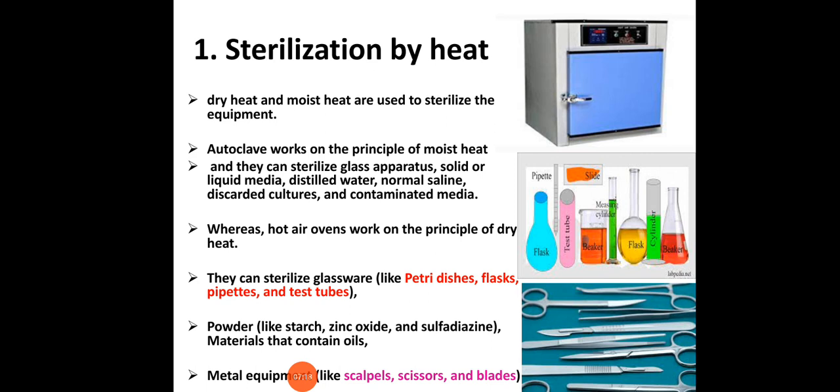The dry heat method is used for glasswares. The glasswares present in the slide are conical flasks, Erlenmeyer flasks, pipettes, test tubes, glass slides, beakers, and measuring cylinders.